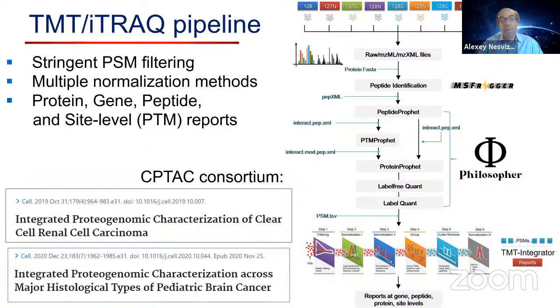In fact, we are running these workflows on so many data sets. As part of the CPTAC consortium, we already published it in 3 or 4 Cell manuscripts now. We are running this on the pan-cancer analysis, and in other collaborations. It's working really well.